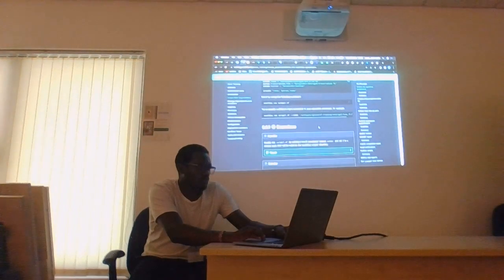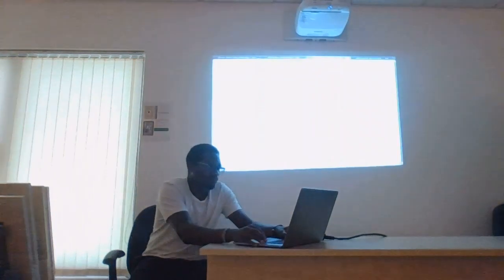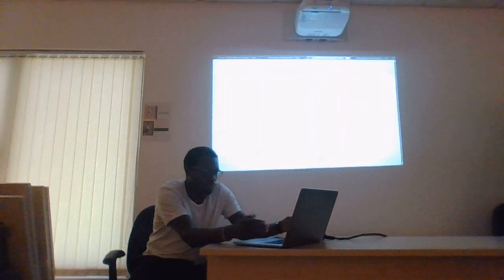Now, once we are done with that, if I want to change my reads, the location, I know I have a parameter called reads, so I can easily use that as an argument or as an option.